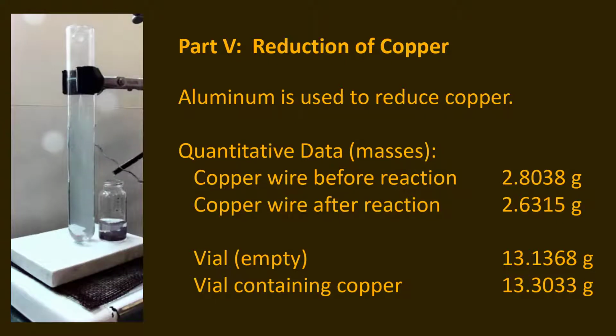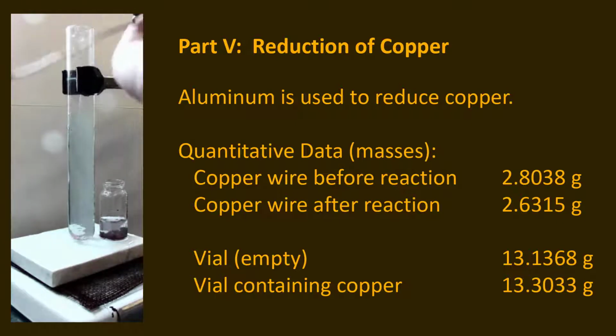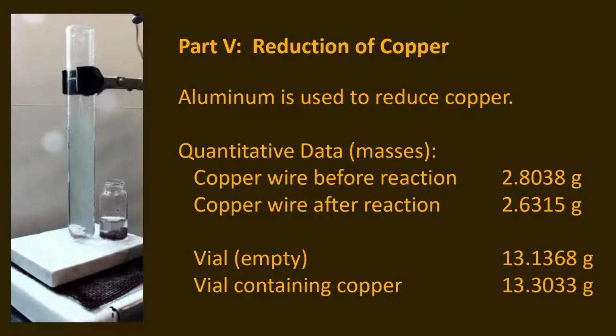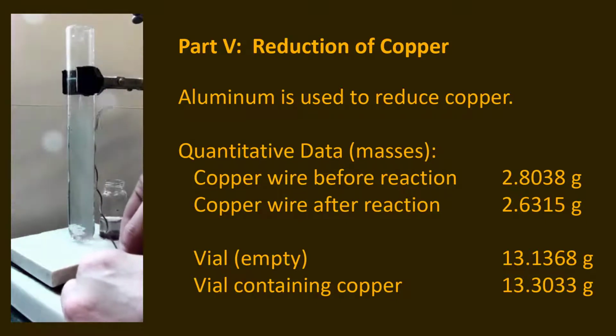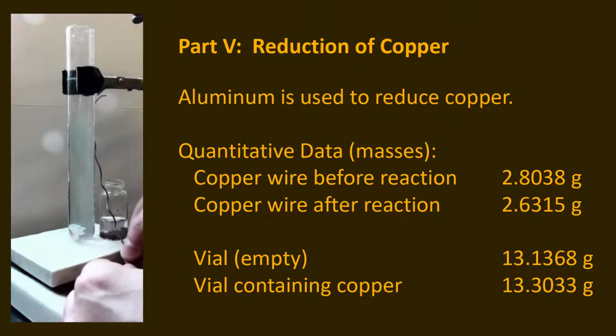And my hope is that after scratching that surface a little bit, when I run water down it, that it'll carry particles in there. But there's always going to be a little bit of product lost, right? So I definitely do see that there is some copper that's still precipitated out on the aluminum wire.